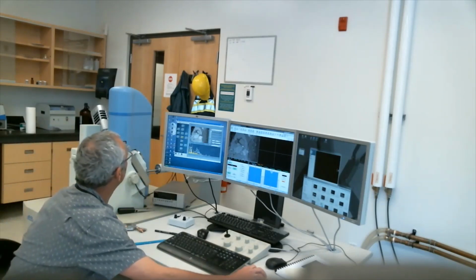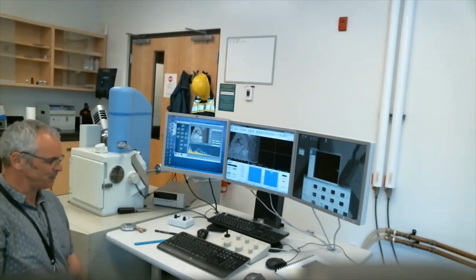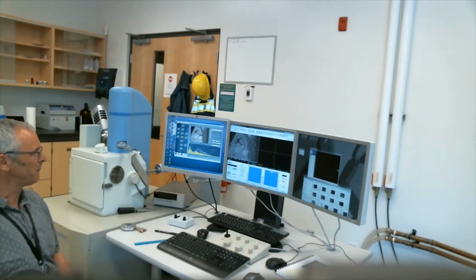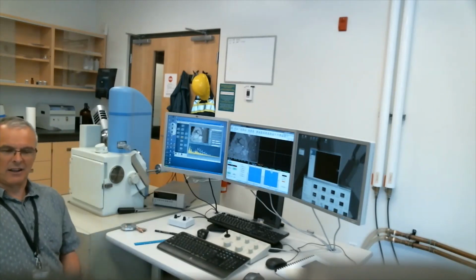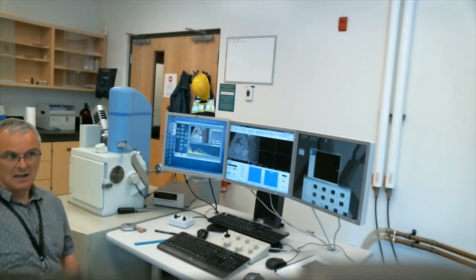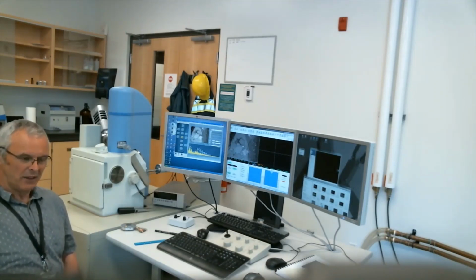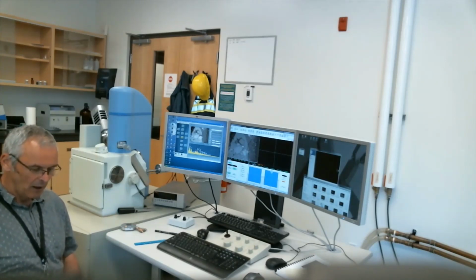And what you're seeing here is a rare earth-bearing phase too, and you can see all these rare earth peaks, and they're all smushed together, which is something we'll talk about a bit later. So this is the worst-case scenario for this. For some minerals, yeah, for the albites, I could identify the chlorides that grow on the surface, as they are big enough. But when I'm looking at small phases like this, I have to be really careful that the X-rays I'm seeing are actually coming from this sample.